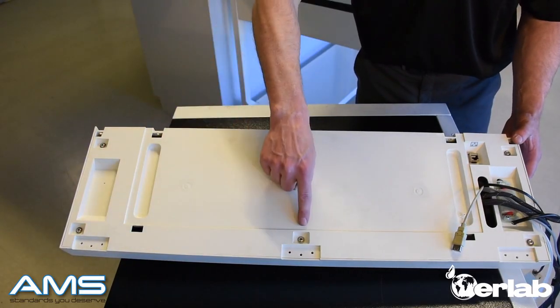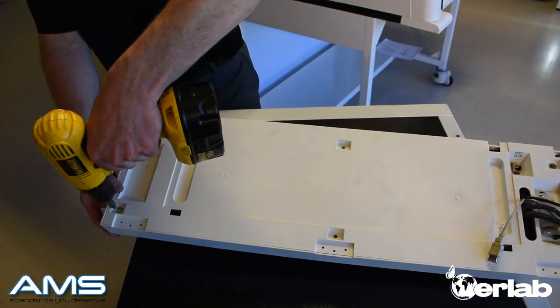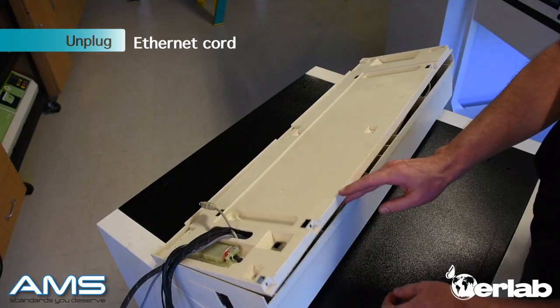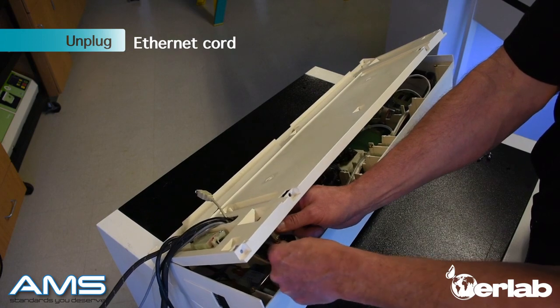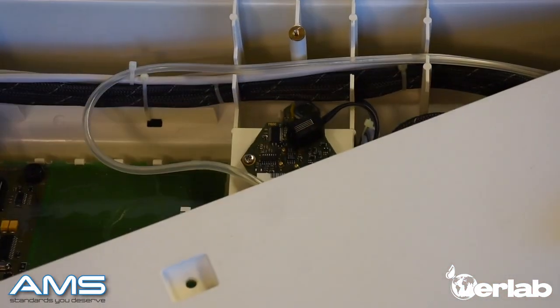Take your drill and remove all 6 screws from the back of the command module. Gently raise the back panel of the command module and remove the ethernet cord that is still attached on the inside. Now remove the cover all the way, exposing the sensors.